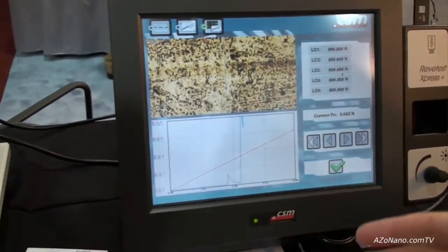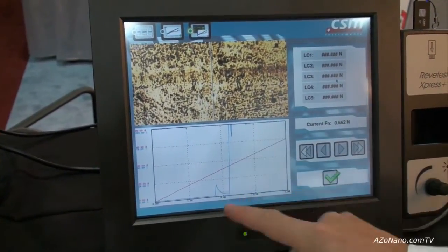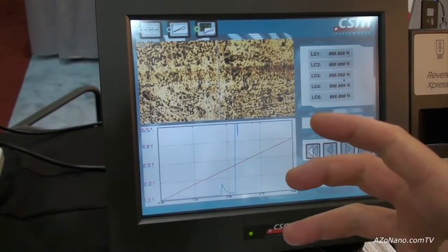So as you can see we're now looking at the data set. This is acoustic emission and we see a jump in the acoustic emission where we had brittle failure of the coating.